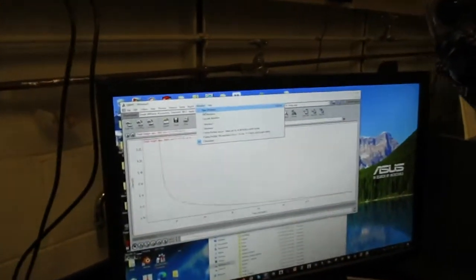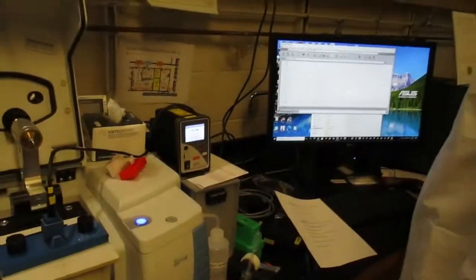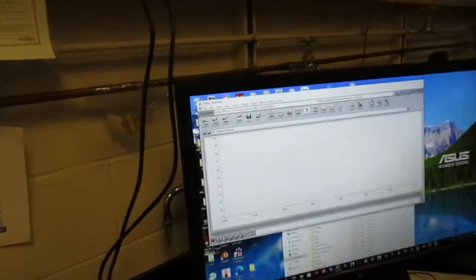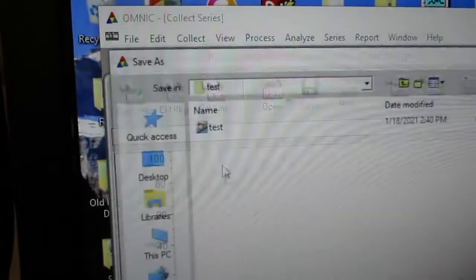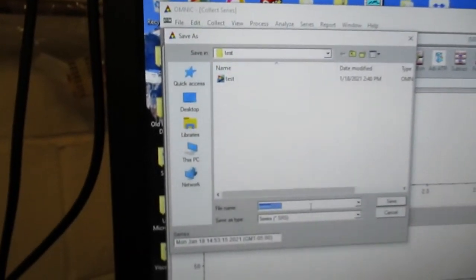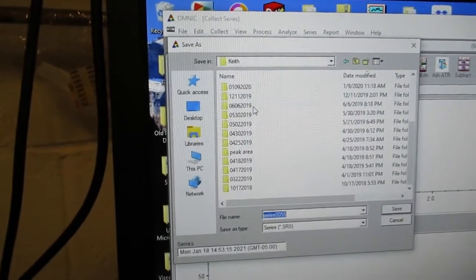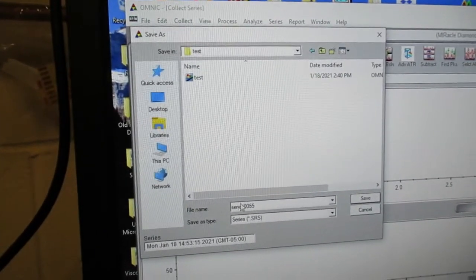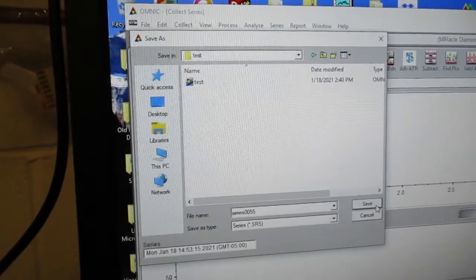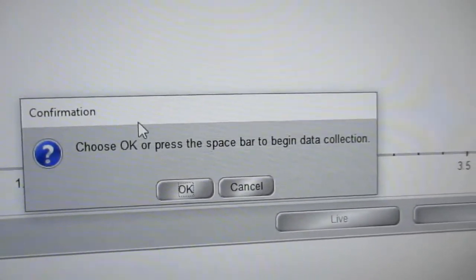Okay. So now we're ready to run our sample. So what you want to do is go to collect and collect series. This will run real-time FTIR. So then you can pick your folder, wherever it may be, and then label it something you want it to be, and then hit save. Okay. Now it's ready to begin data collection.